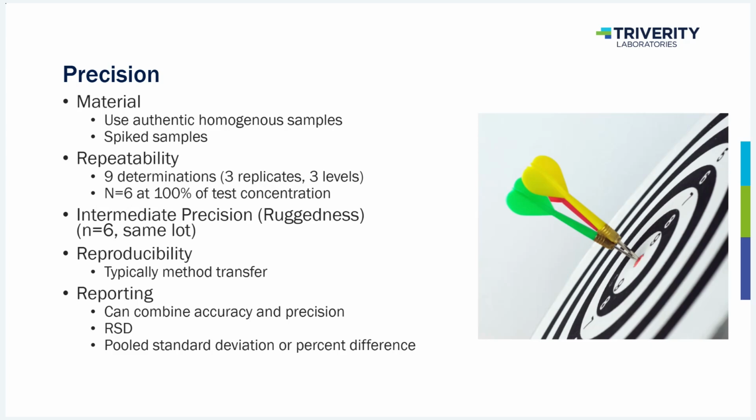So it's very possible that you can perform precision and accuracy using the same samples, especially if you're really lucky and you have in-house formulations, in-house product development that can make you drug product at 70, 100, and 130% of the target concentration. Then you can just test your drug product as formulated for your accuracy, and you're not having to do spikes.